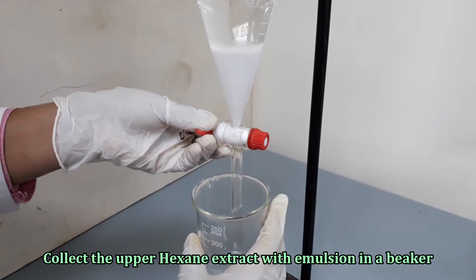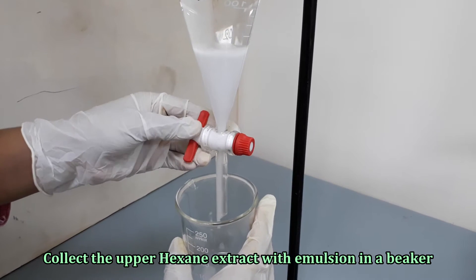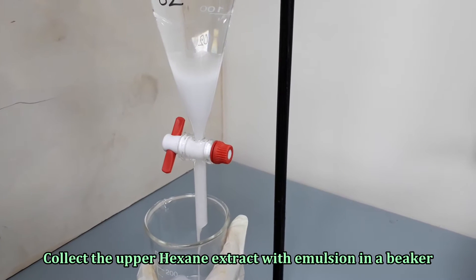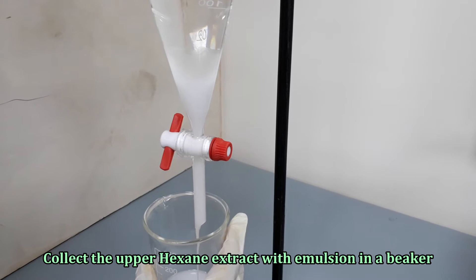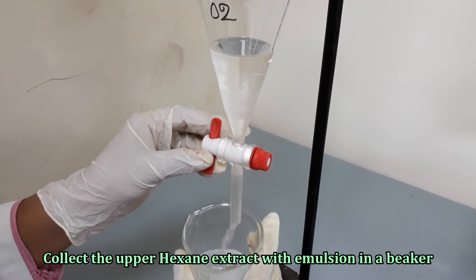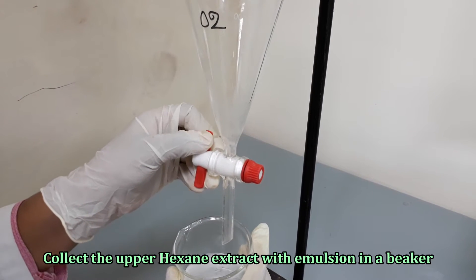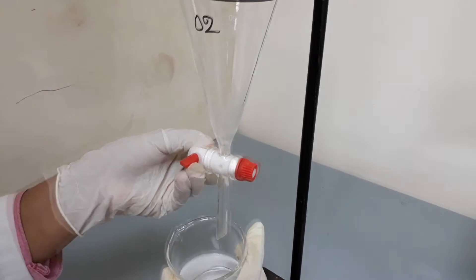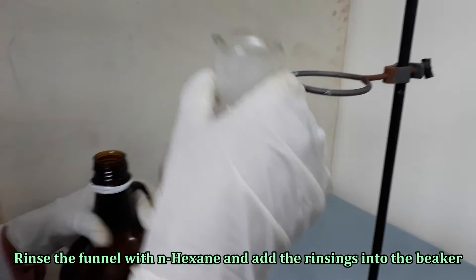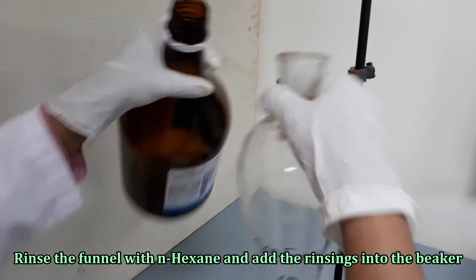Transfer the hexane extracts along with the emulsion into a beaker. Rinse the separating funnel with n-hexane and add the rinsing to the hexane extracts.